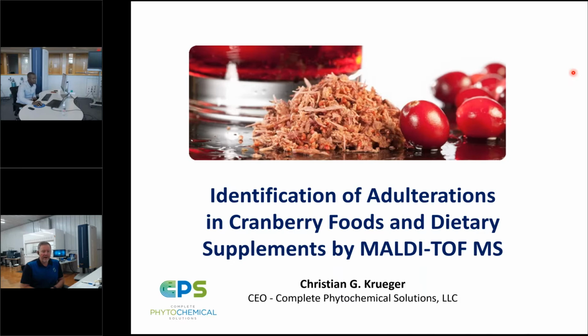We're embarking on a collaborative effort here to promote the use of MALDI-TOF mass spectrometry to address evolving issues of adulteration in the natural product, botanical, food, beverage, and supplement space. So what we'd like to do today is focus in on an issue regarding the adulteration of cranberry foods and dietary supplements, and just use this as an example and a platform to demonstrate what a workflow looks like in an operating contract laboratory.